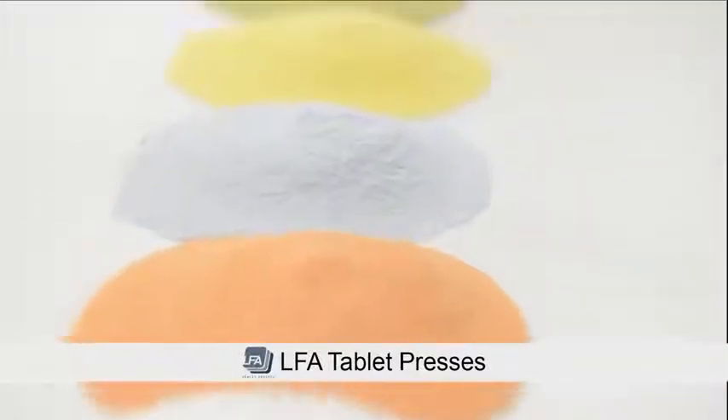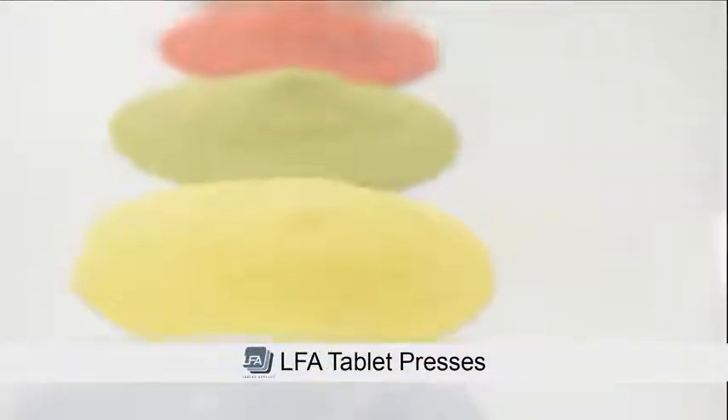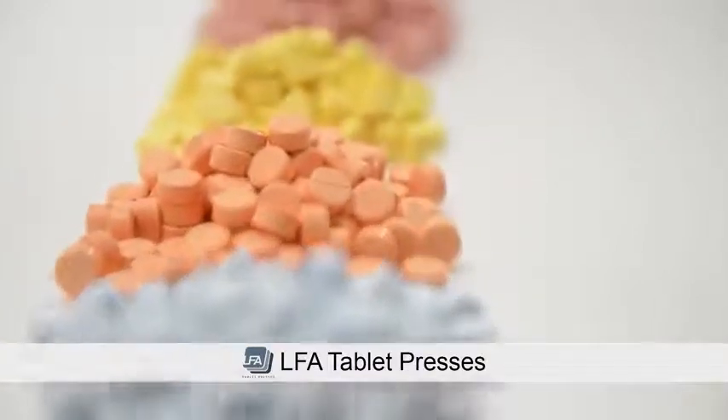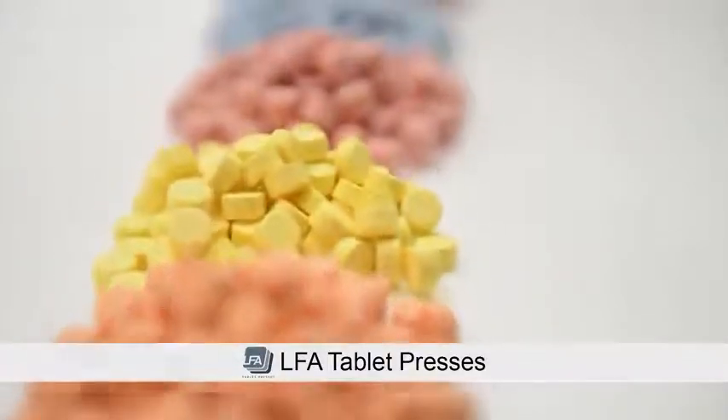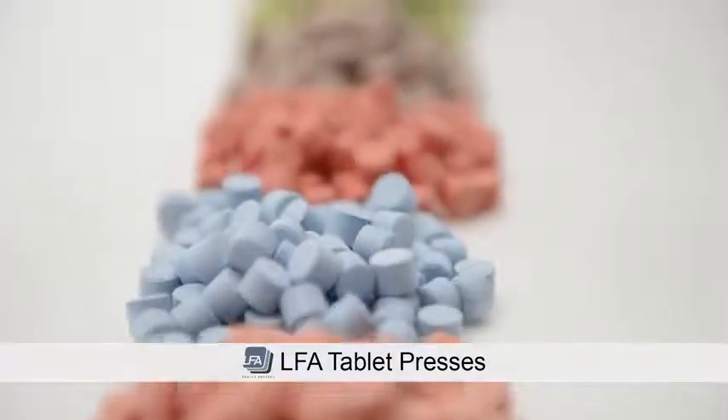Firmapress is an all-in-one tableting mix. This product has been specifically designed by LFA to make tableting an easy process. Firmapress removes the stress of researching and developing your own formula and will produce consistent high-quality tablets while saving you both time and energy.